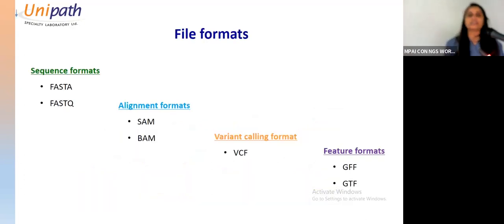Now, to understand the basics of all the tools, it's very important to understand the formats. We are all very different people, we understand certain types of things, we are able to speak certain languages. That type of limitation is also there with the tools. They understand different types of formats. They have certain limitations, or you can say they are more focused on a certain part. That's why they have a certain format which they are able to understand. So these are all the formats which are taken by one tool or another to give you meaningful variant interpretation.